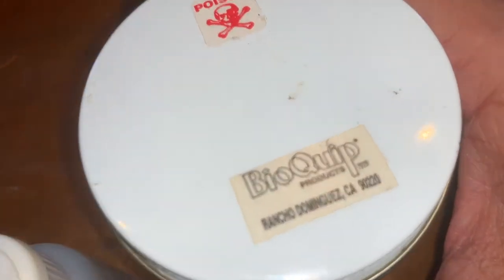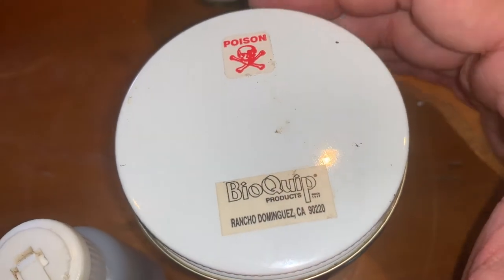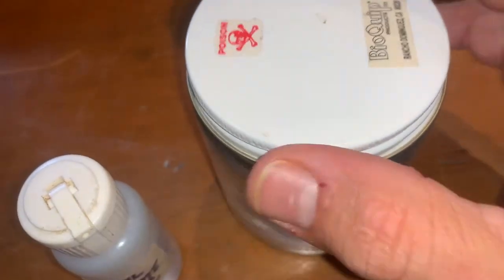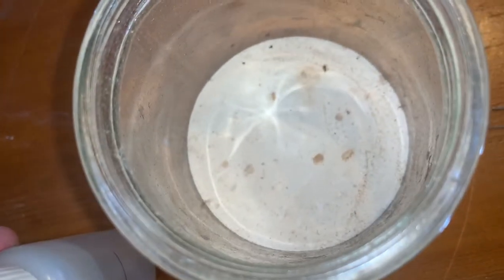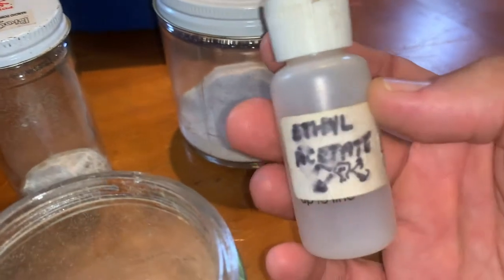I always make sure our kill jars are labeled with a poison label. You can buy all your kill jars at BioQuip Products — we have a link in our description. We've been ordering from them for over 30 years. When looking into your jar, it's just plaster on the bottom with ethyl acetate, and one key thing is that ethyl acetate evaporates very, very quickly.